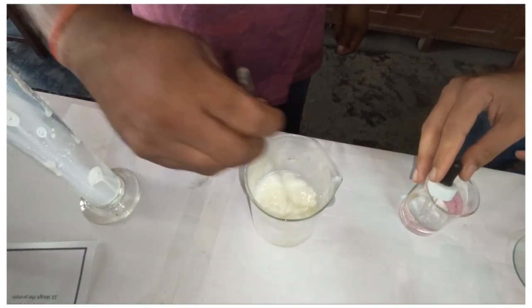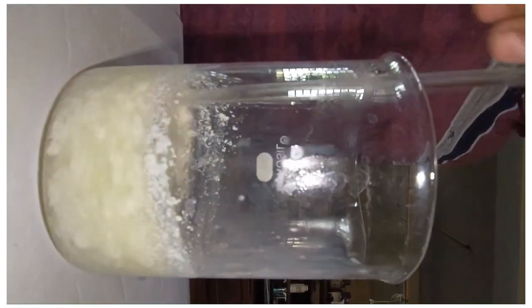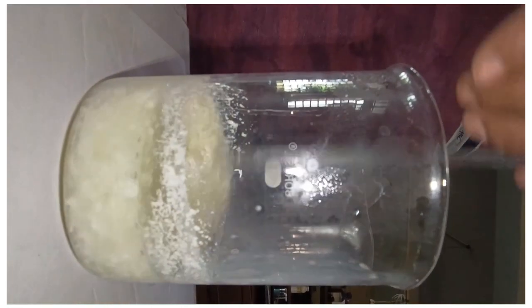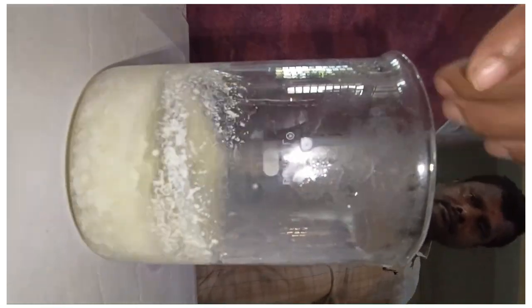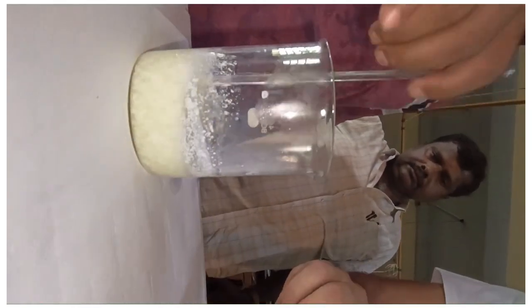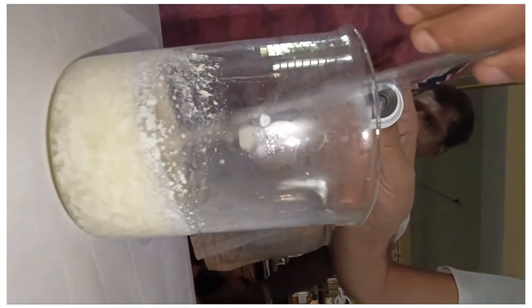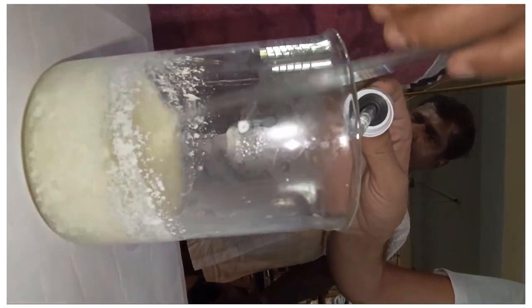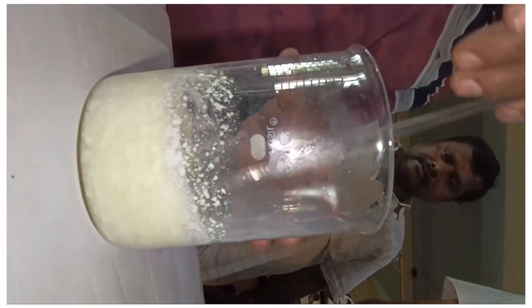Near about 10 seconds, sir. Please come. A new experiment is going on in PG chemistry semester 4. Please come, sir. In this case, we will see what amount of casein is present in milk. And just to answer, you add 1-2 drops of acetic acid. Dharmender sir, please come. Another one. Casein, yes.